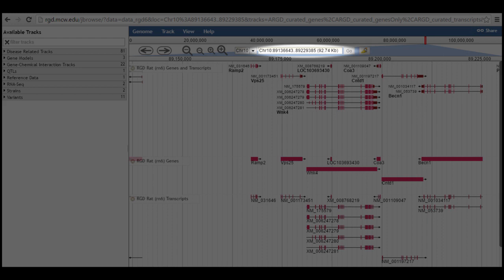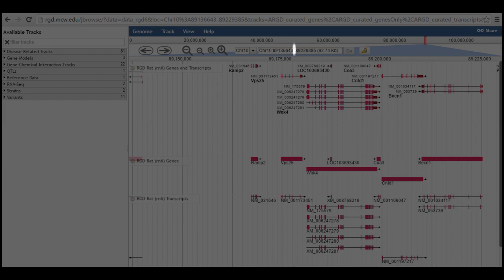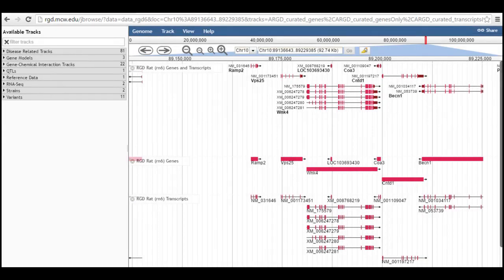If you know the chromosomal position of the region you are interested in viewing, you can enter this into the search slash position box in the format chromosome number, colon, start position, two dots, and stop position. Alternatively, you can enter the symbol or the name of an object in jbrows to navigate to that object.